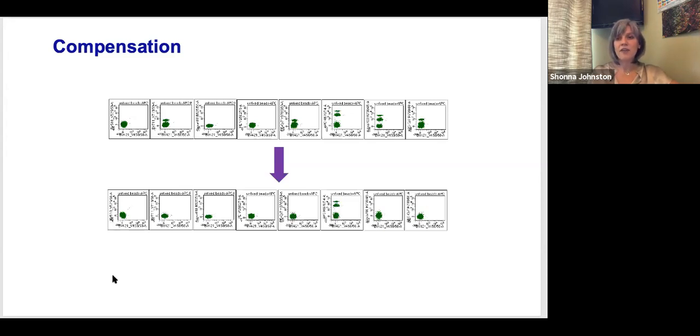Now this is great for our users. That actually really helped us move from filter-based systems onto spectral analysis, because they had some understanding about what things are doing. And this is pretty much how it works with the BigFoot, and maybe even if you're trying to do spectral flow cytometry using, say, a Symphony or something like that, you're looking at the non-primary detectors for the fluorochrome that you're interested in.